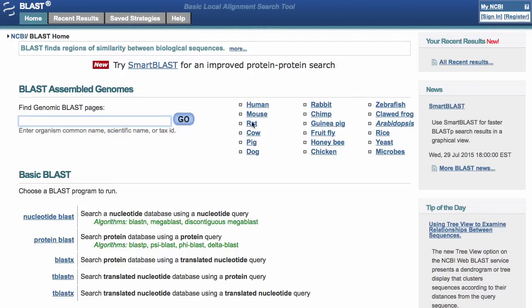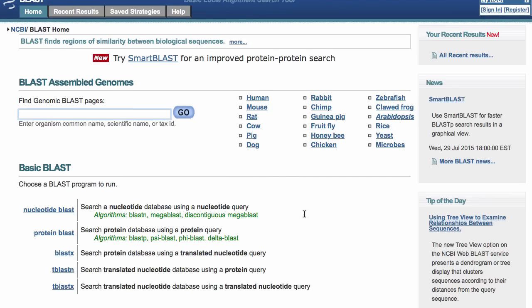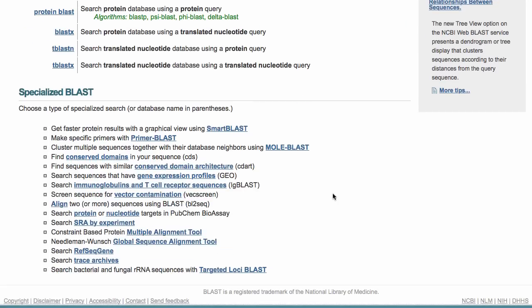At the top you see genomes, and there are a number of organisms listed — human, mouse, and such — and there's also a search box to find a genomic dataset for any organism not listed here. We're going to come back to that in a bit. There are also links for more traditional types of BLAST below, and finally specialized BLAST links at the bottom.